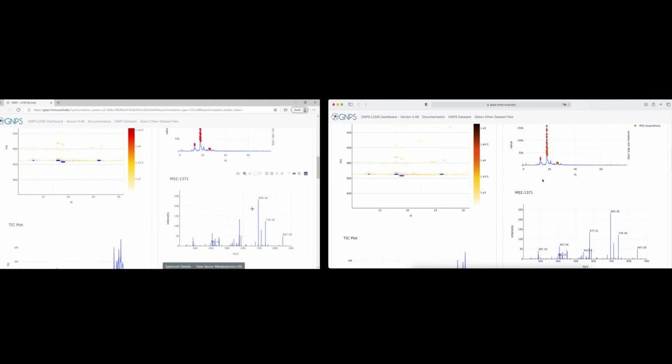This way, a PI and another researcher can easily set up a collaborative session to discuss fragmentation patterns of a specific group of molecules, review data, provide feedback, and further all of these remotely. PIs can also take advantage of using public datasets to train students.